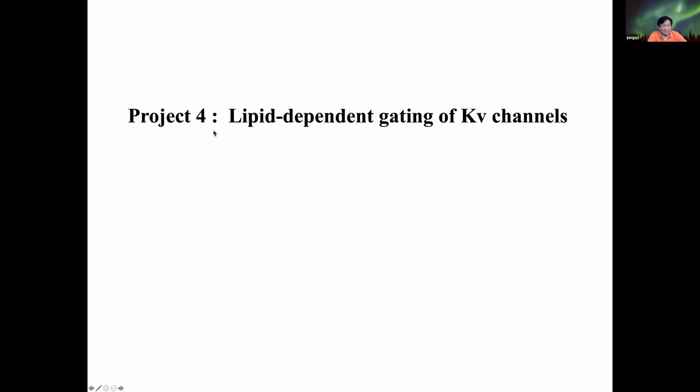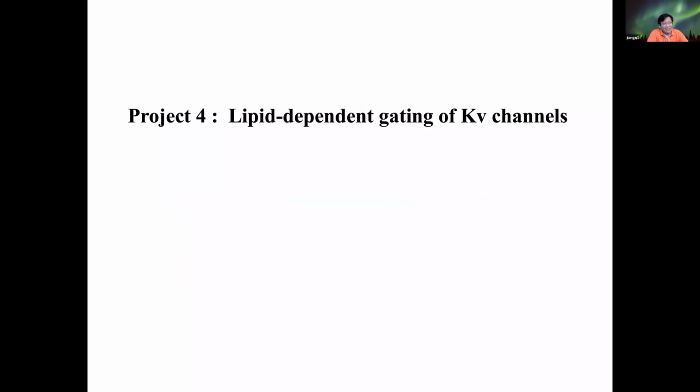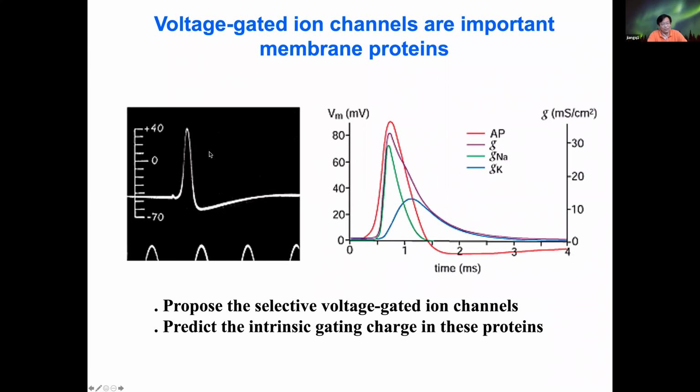So in this part I demonstrated to you that Cryo-EM at different resolution ranges can really help to address very important biological questions in nature. The last part, I will tell you a story quickly about a major discovery we advanced, which we called lipid-dependent gating of voltage-gated potassium channels, or called KV channels.